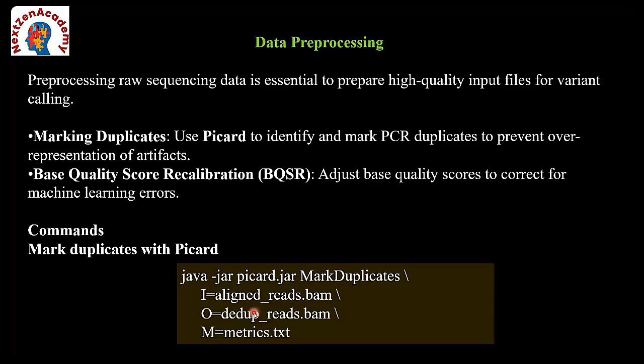It provides very accurate results and is now widely used. But I don't have experience with it right now. I need to work with it. Very soon, I'm going to work with DeepVariant, so I'll get a better idea.